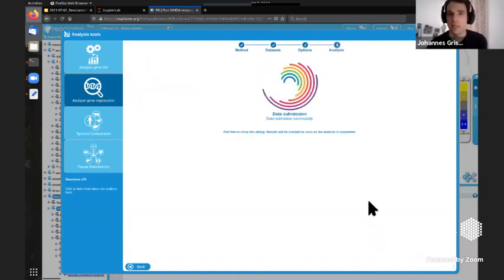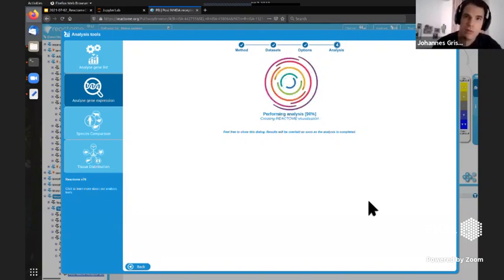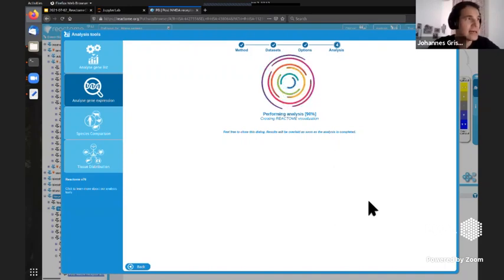As you saw, this is quite neat. You can just play around with this, check how CAMERA performs, how PADOG performs if you have a two-group comparison. And here the group comparison parameter that you entered, so here it's drug versus control, is completely ignored, since ssGSEA maps my expression values on the pathway level. This is the easy part. The more interesting part is how to analyze this data.